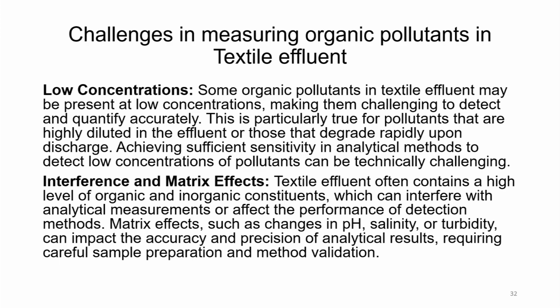So, there are challenges. Although it is recommended, many methods are very apt for analysis, but still they are very challenging issues, especially for low concentration pollutants, for matrix interferences and so on.